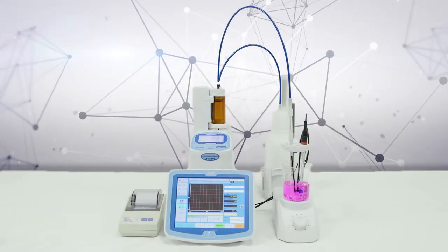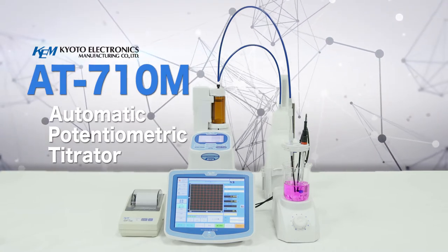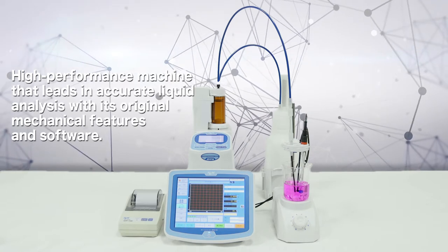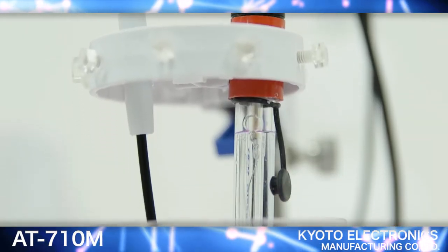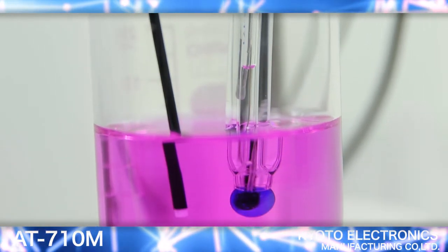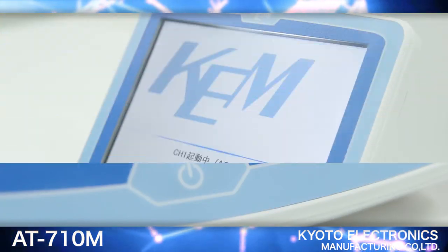The AT710M is a high-performance automatic potentiometric titrator that leads accurate liquid analysis with its original mechanical features and software. In addition to measuring acidity and salinity, it is an AT series automatic potentiometric titrator which can be used for various types of concentration analysis.